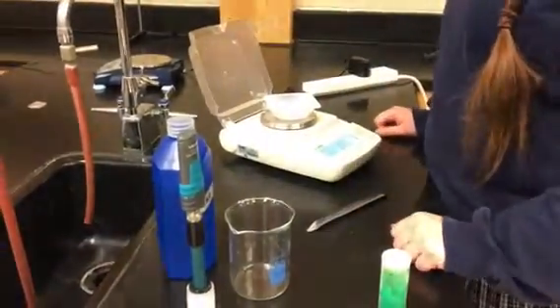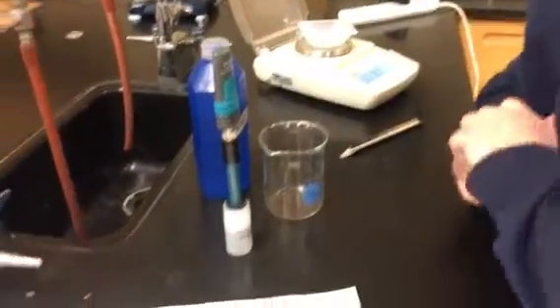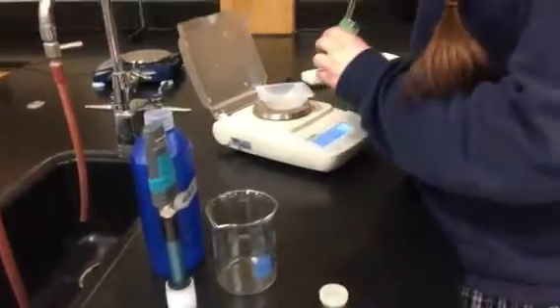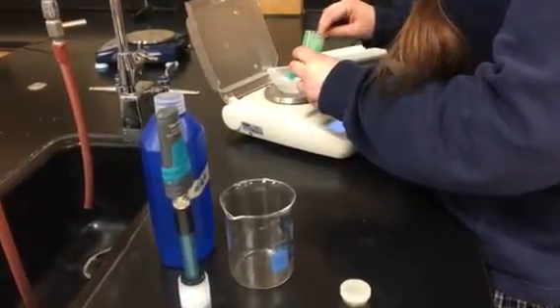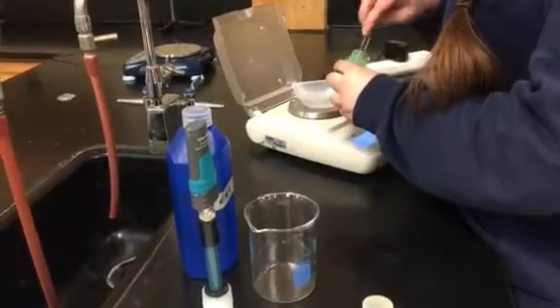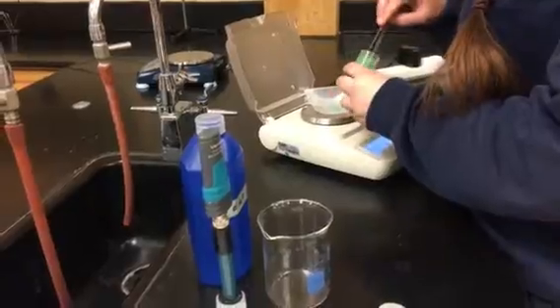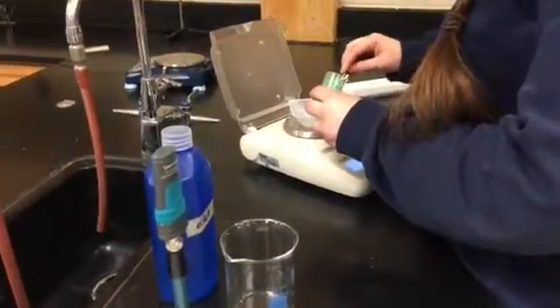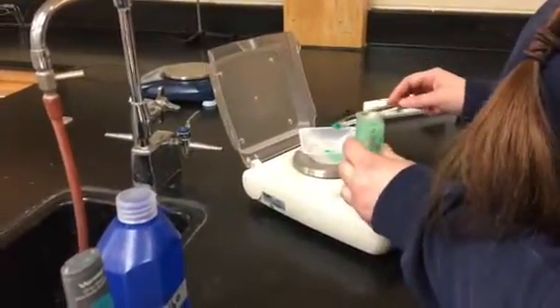When Megan and myself decided to test the pH of chlorides, we had the task of choosing which chlorides would be efficient for our experiment. We chose to use 8 chlorides so we would have a lot of variety for best data variation. We chose the following 8 chlorides: aluminum chloride, ammonium chloride, calcium chloride, copper 2 chloride, iron 3 chloride, magnesium chloride, potassium chloride, and sodium chloride. We chose those 8 chlorides because they were most accessible and attainable in the lab and easiest, we felt, to use.